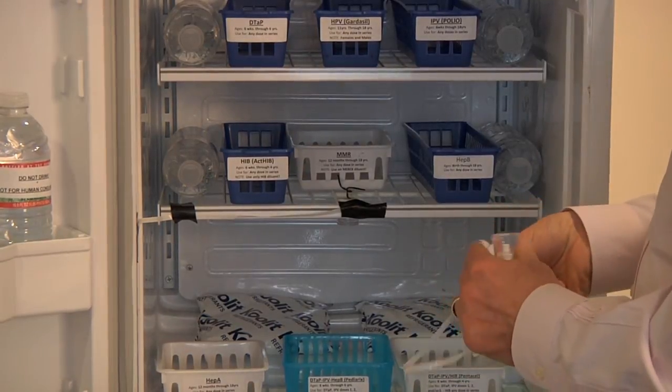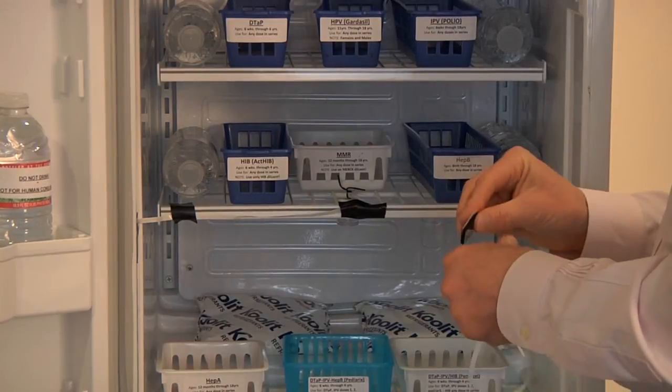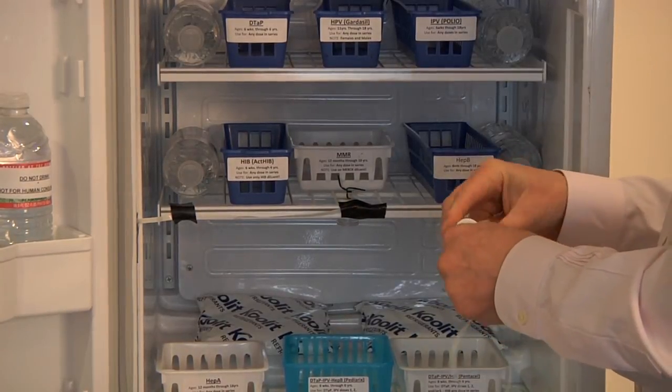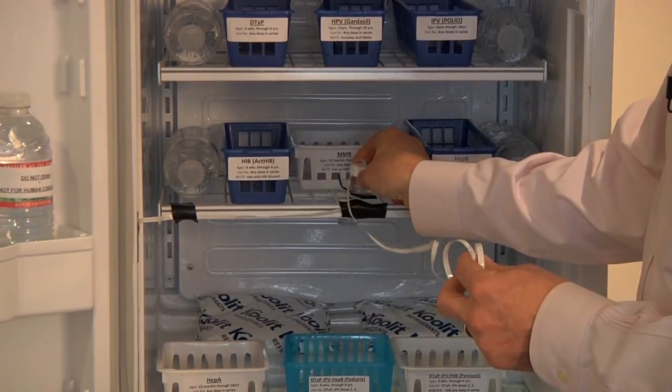If you have a glass shelf, you may take a piece of Velcro and adhere it to the bottom of the probe in order to hold the probe in place in the center of the unit.